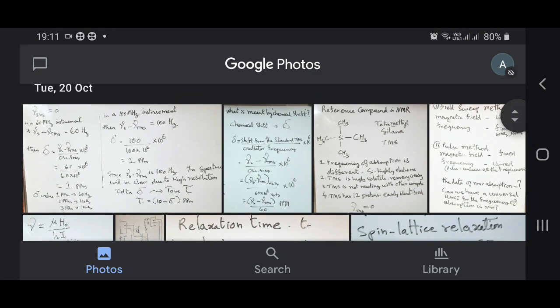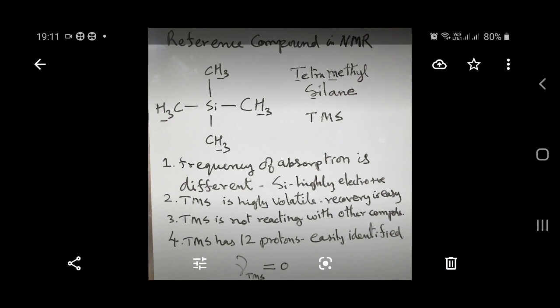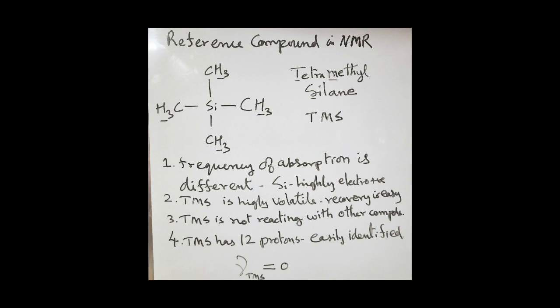So, first, to derive the unit, namely chemical shift, we are recording the NMR spectrum with a reference compound. Tetramethylsilane is the reference compound. With reference to the 12 protons of tetramethylsilane, the experimental compound and its chemical shift values are compared by the NMR spectrometer itself with the help of a microprocessor. So it is converted into a common unit called chemical shift, which is a derived unit.